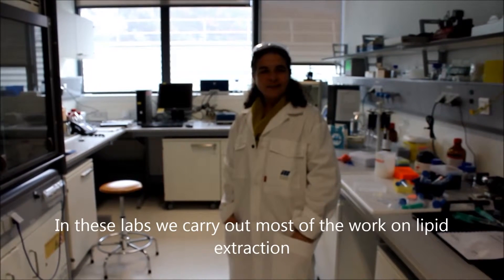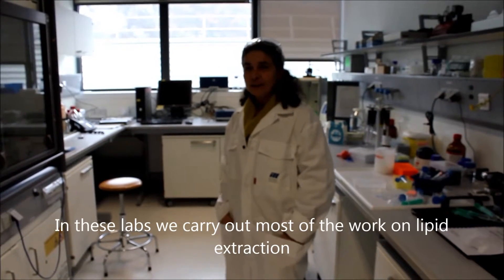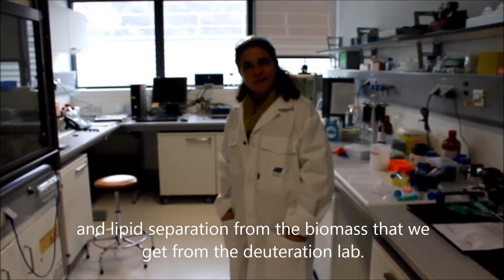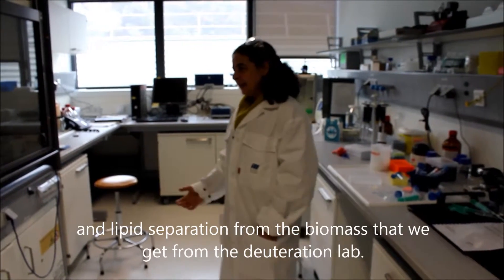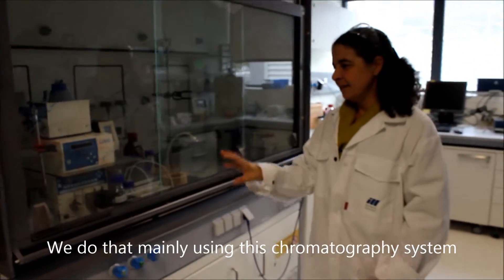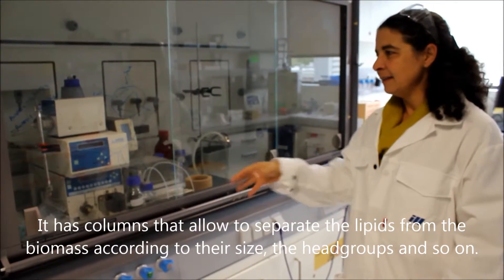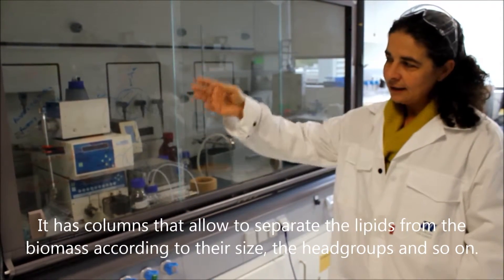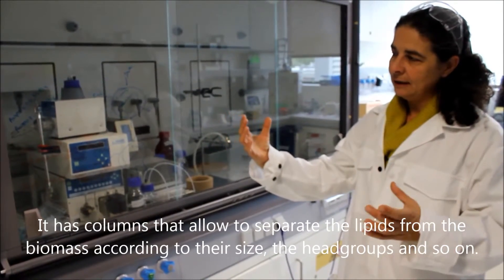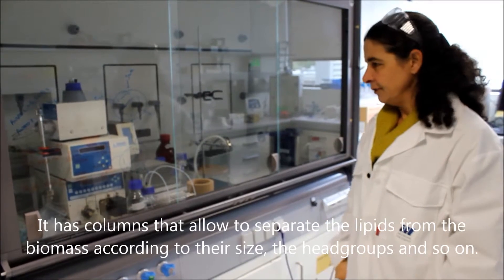In this laboratory, we carry out most of the work on lipid extraction and lipid separation from the biomass that we get from the deuteration lab. We mainly do that using this chromatography system — an HPLC system with columns that allow us to separate lipids from the biomass according to their size, according to the head groups, and so on.